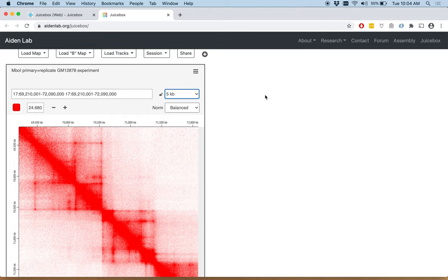Now we're going to look at how you might load annotations to explore further what to do with this kind of map.